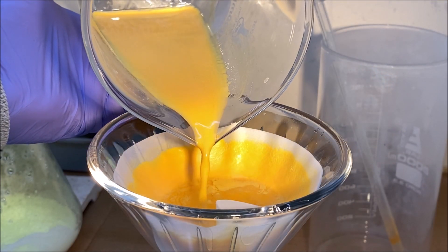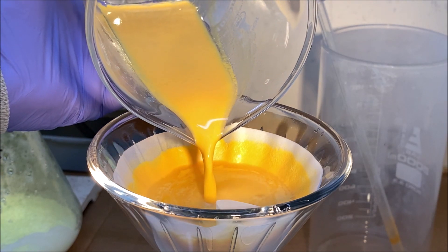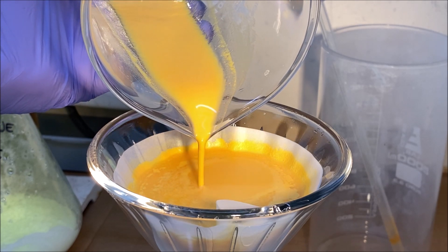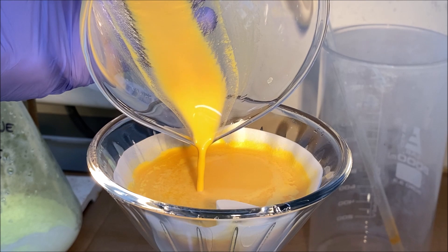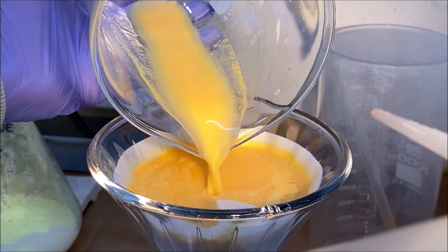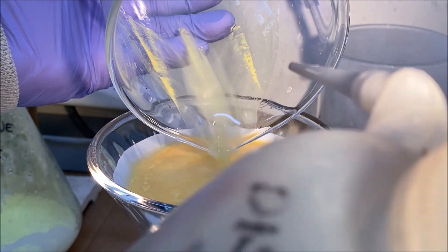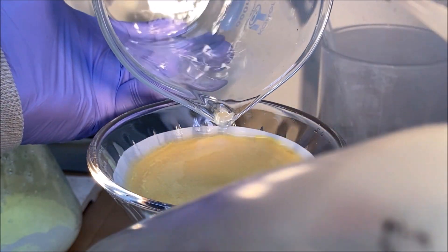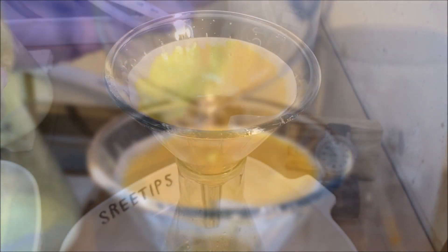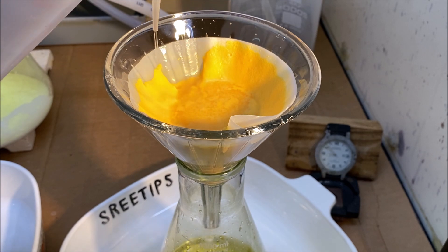This precipitate is not soluble in water, so I can use cold distilled water to rinse it out of the beaker and to rinse the material off this filter. I'm going to rinse the precipitate with some cold, still water.